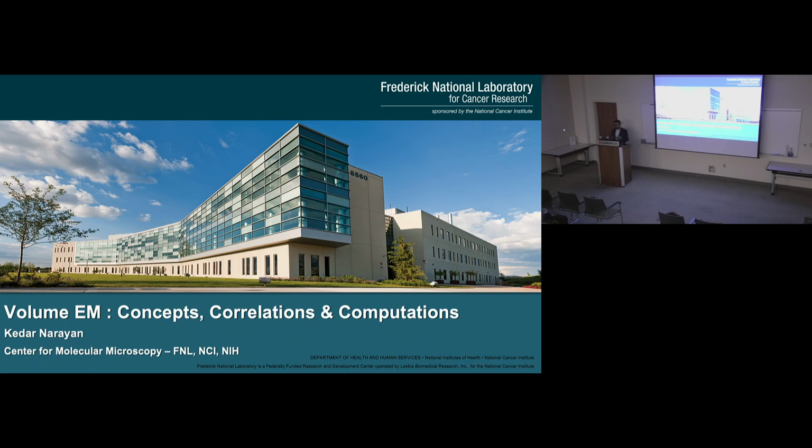And rather than jumping directly into the computational aspect of things, because I understand that the awareness about what volume EM is might be a little different within this audience, I'll talk a little bit about some of the concepts of volume electron microscopy. I'm also going to talk about how it can be really empowered by using correlative approaches where you image the same thing using multiple imaging modalities. And finally, some computational work that we've been doing in the AI space to help alleviate bottlenecks in the pipeline.